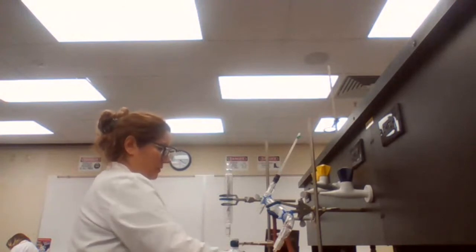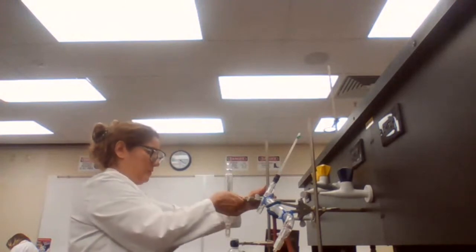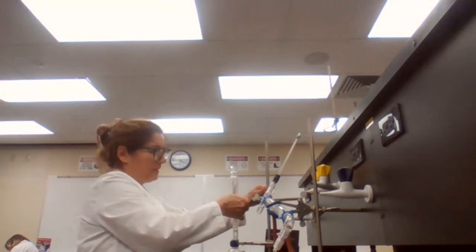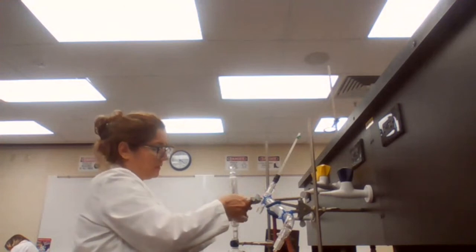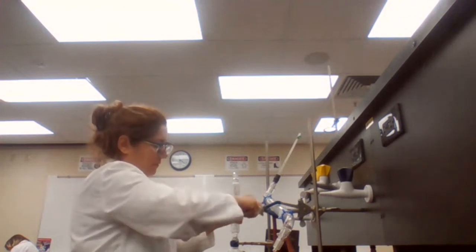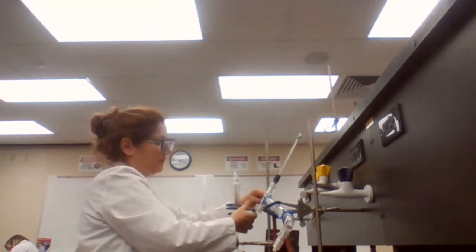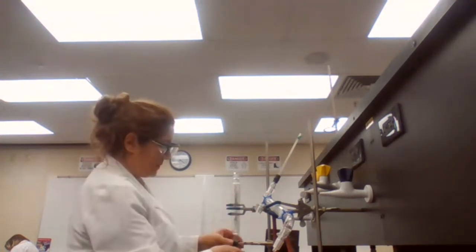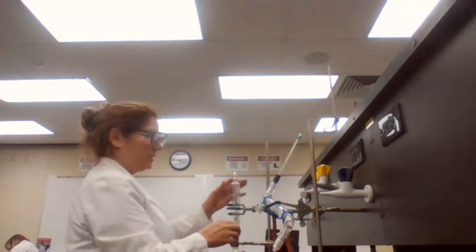So I'm going to assemble this part first and then open it to add the chemicals.